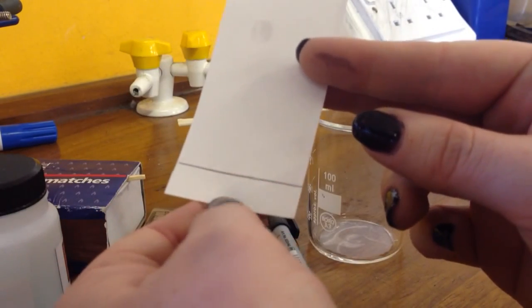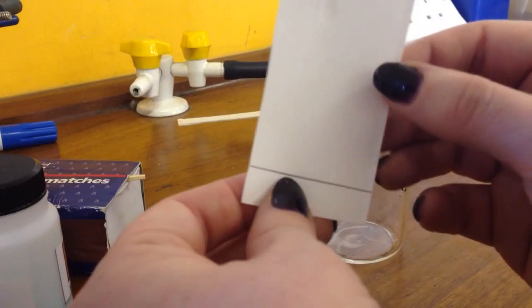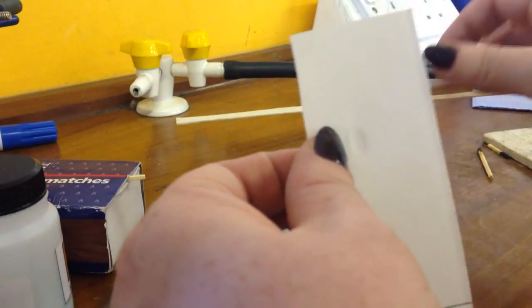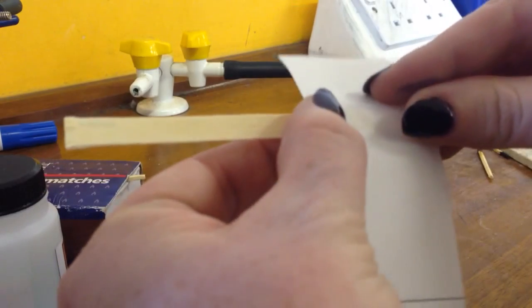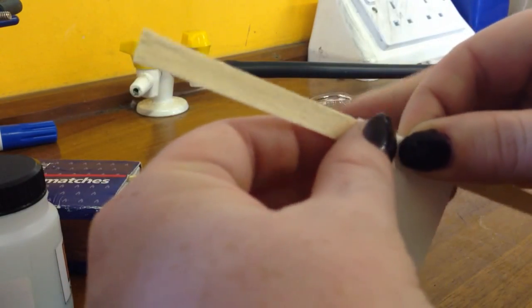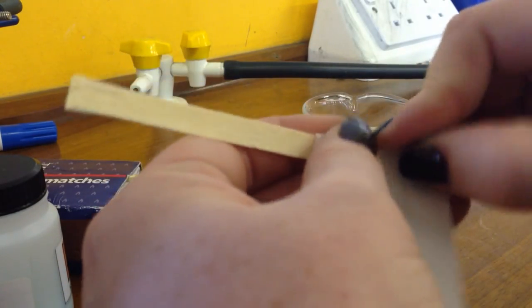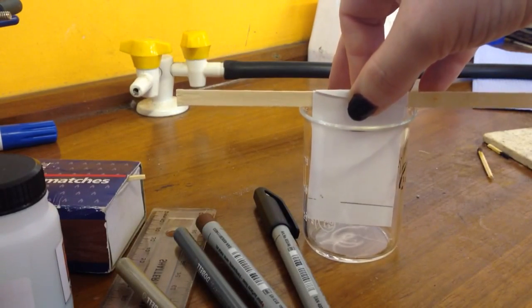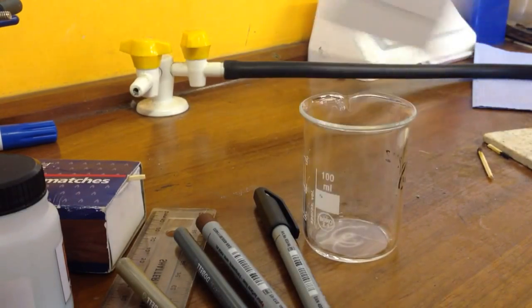You need a bit of filter paper with a pencil line drawn about 2 centimeters from the bottom. Just rest that against the beaker and take a splint and wrap it around the top so that when you pop it back in your beaker, the bottom of the filter paper doesn't quite touch the bottom of the beaker.